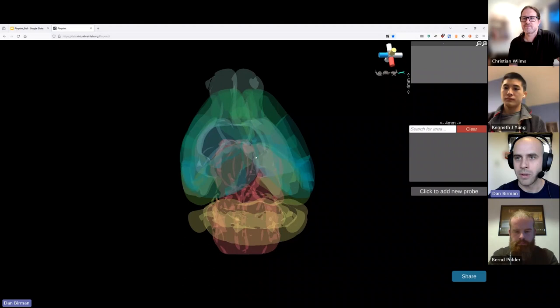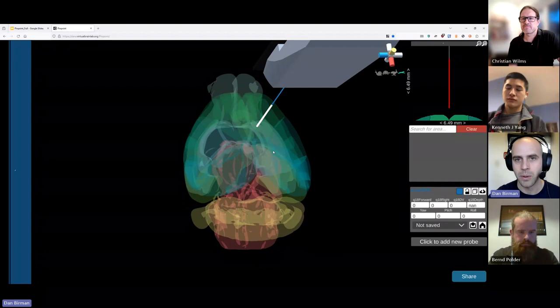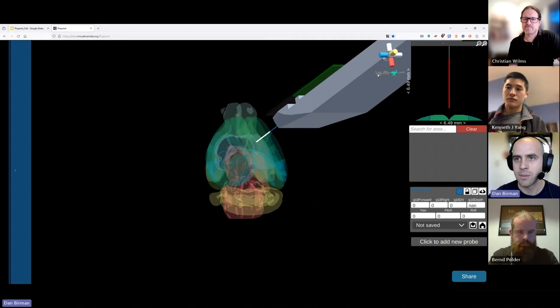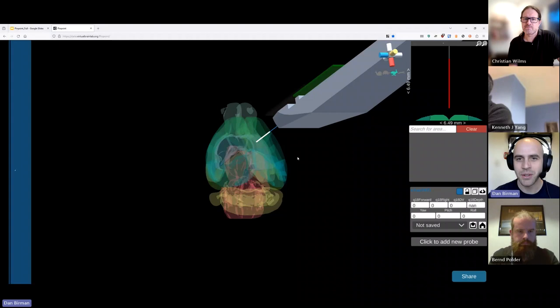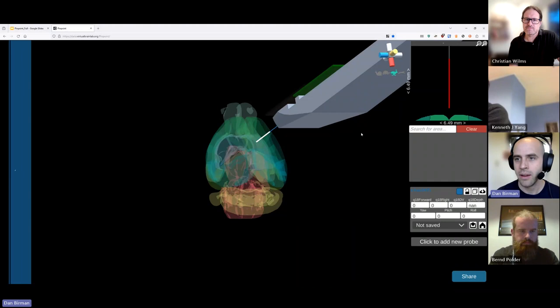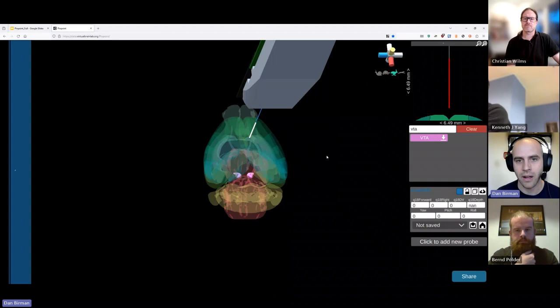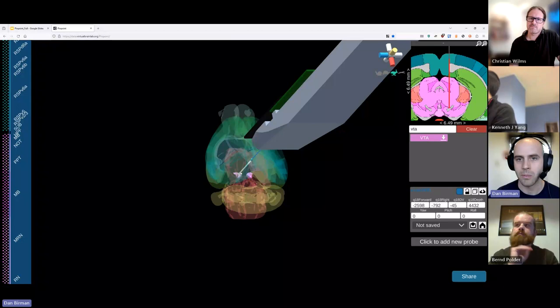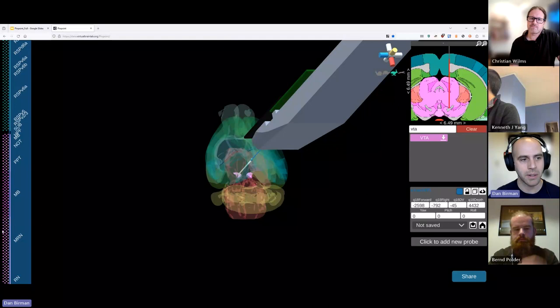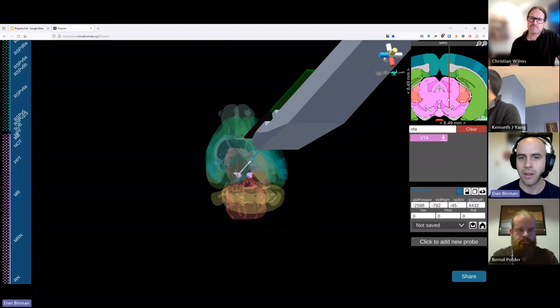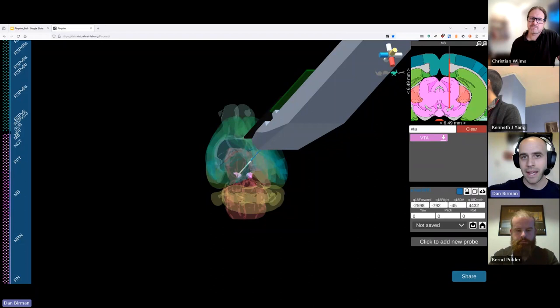You can zoom in and out with your scroll wheel. I'm going to drop a Neuropixels 1.0 probe into the scene. My recommendation is to move probes by snapping them to a brain region first, then adjust the position. Let's imagine we're trying to hit the ventral tegmental area — VTA in the CCF. We can turn that region on as a 3D model and use the snap button to move the tip of the probe there. When snapped, the channel map appeared on the left and the in-plane slice got filled out with a view of the electrodes.